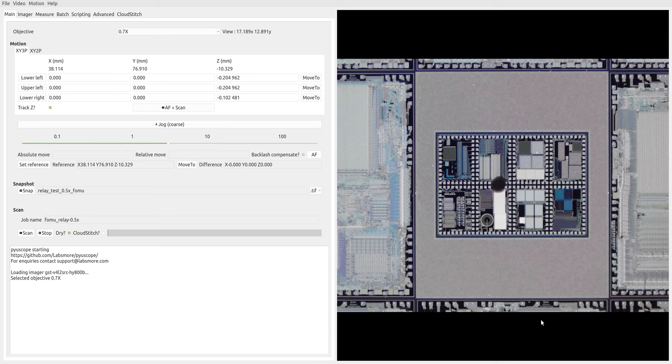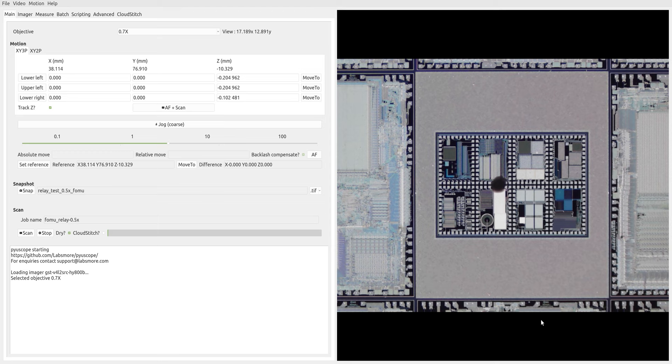Hello there. In this video, we're going to use Piuscope to take snapshots of a regular array of samples, such as a tray of parts, or in this case, sites on a silicon wafer.